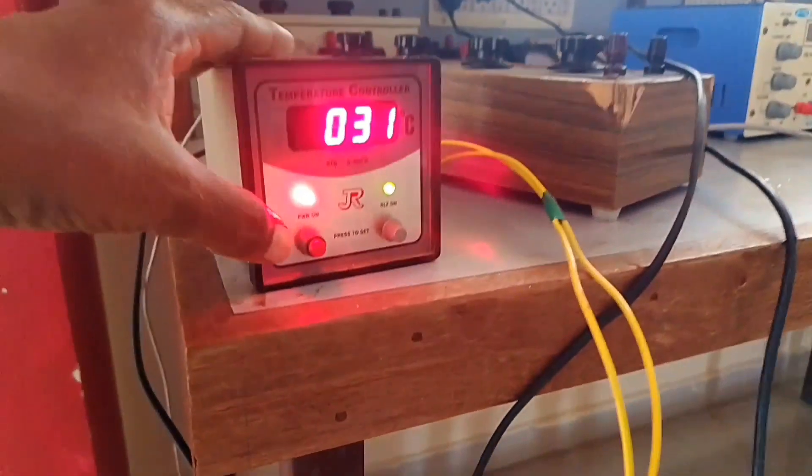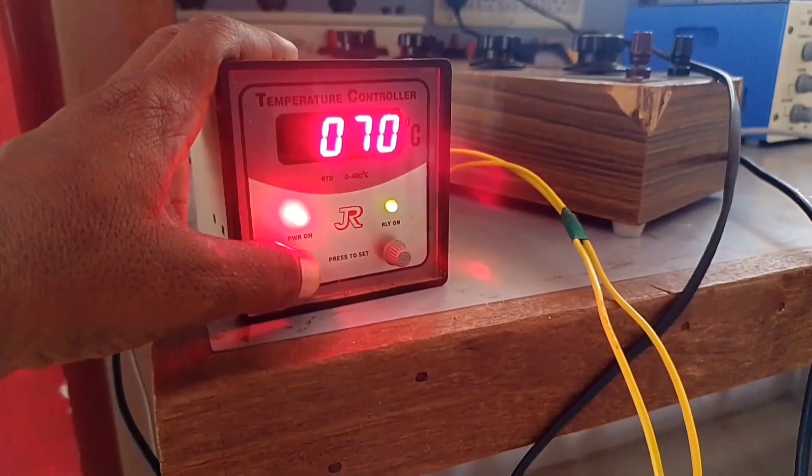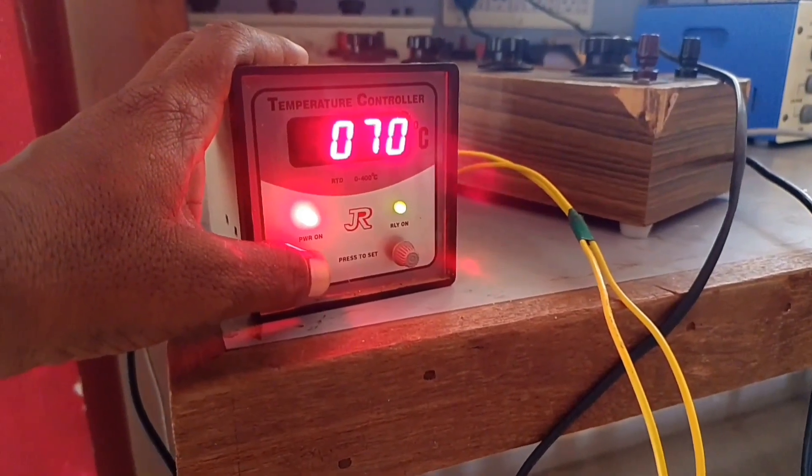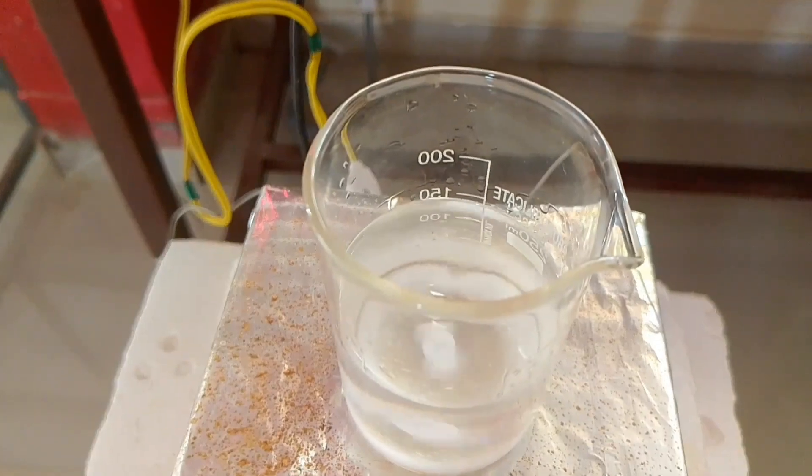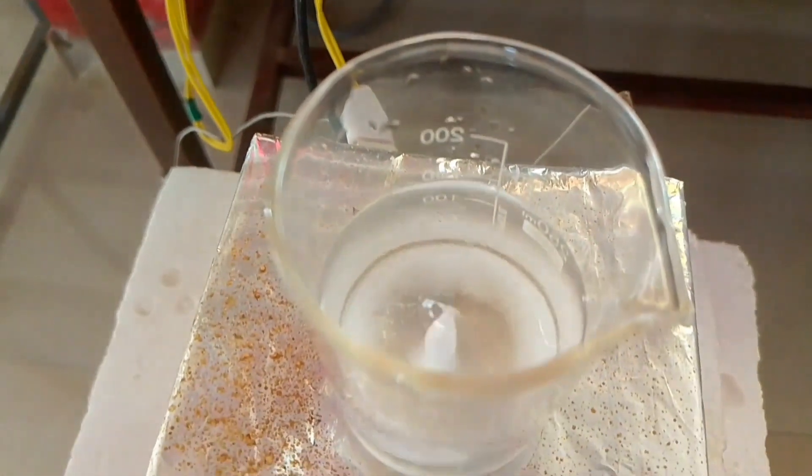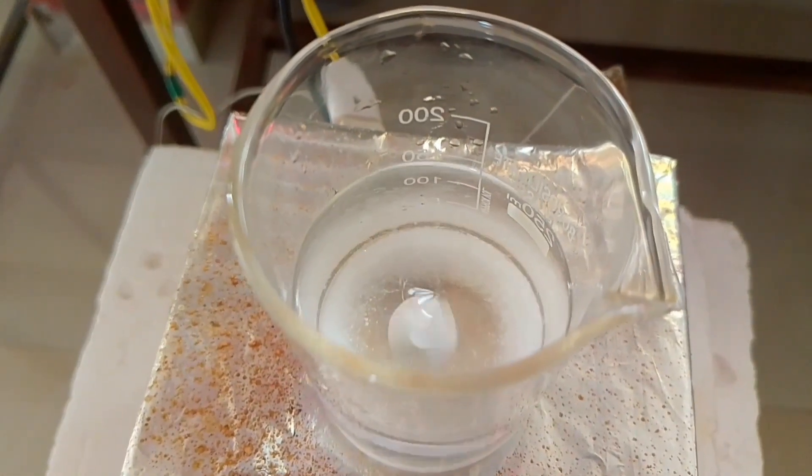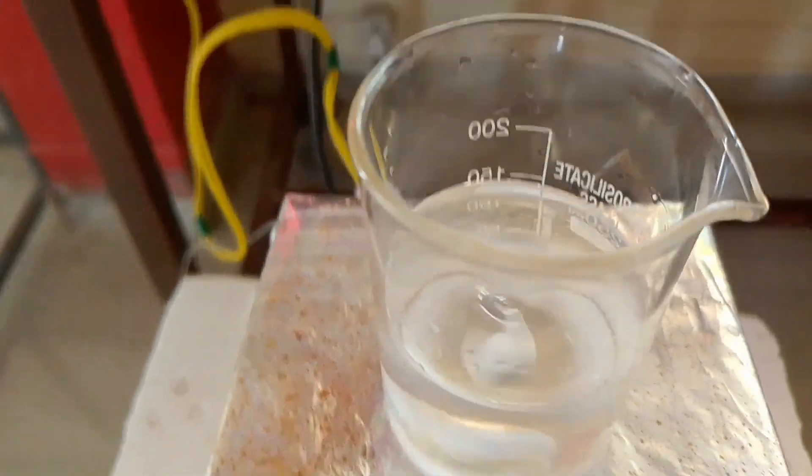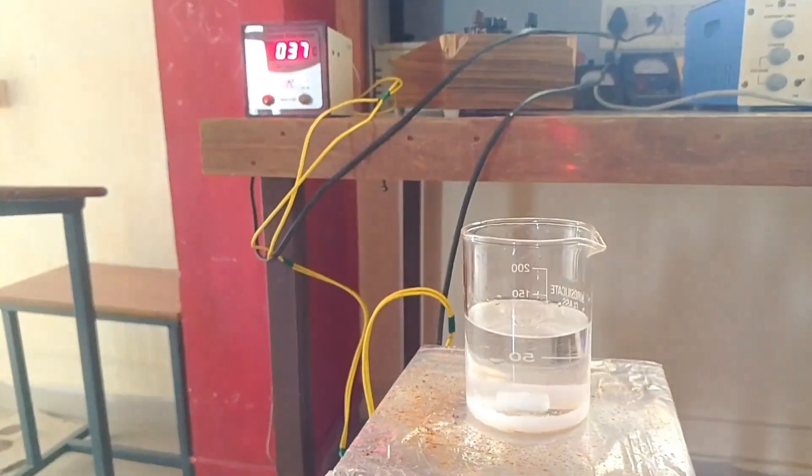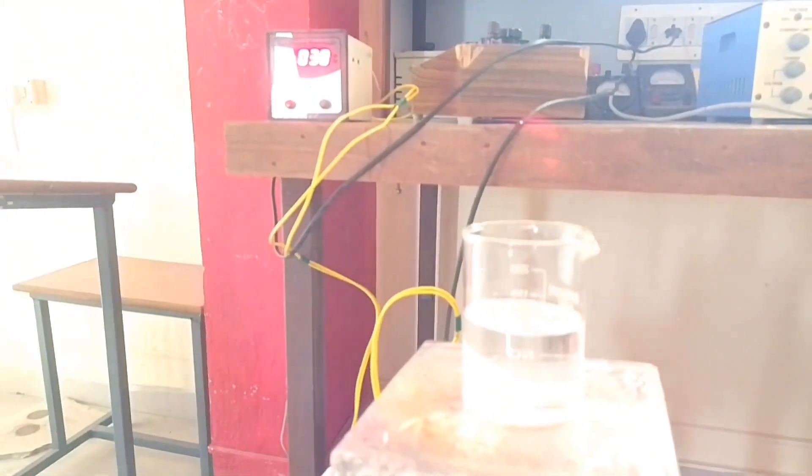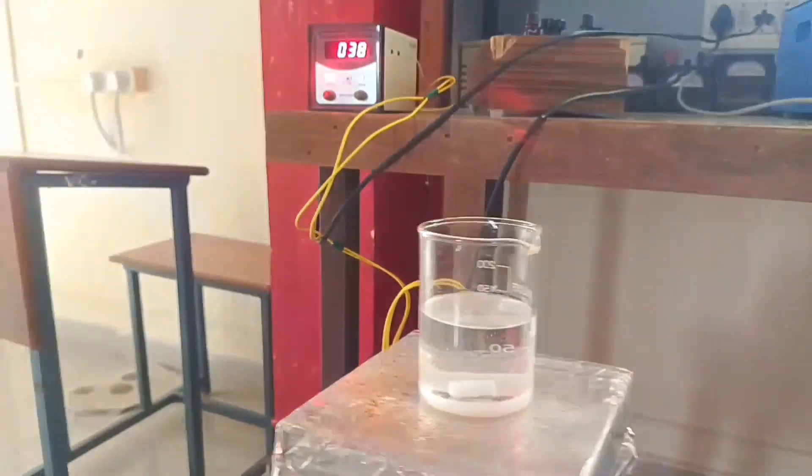I am going to stir this solution at a temperature of 70 degrees centigrade. You can see on the screen the solution is stirring with the help of hot plate magnetic stirrer. This hot plate is externally connected to a microcontroller controlled temperature controller.